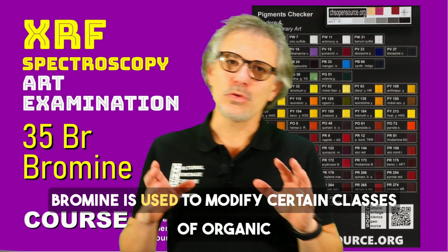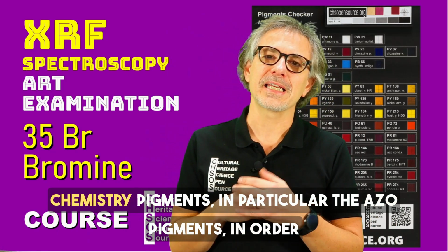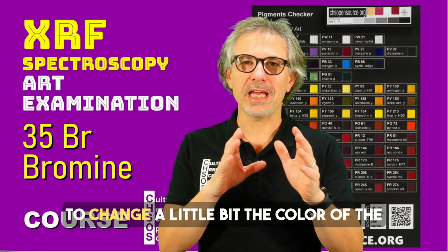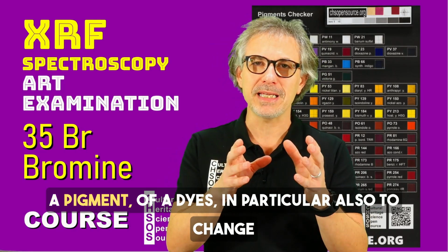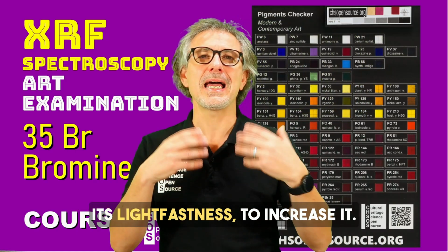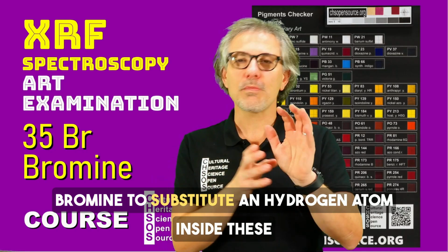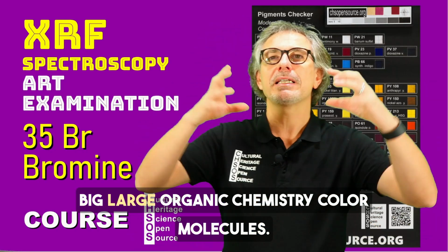Bromine is used to modify certain class of organic chemistry pigments, in particular the azo pigments, in order to change a little bit the color of the pigment, of the dye, in particular also to change its light fastness, to increase it.